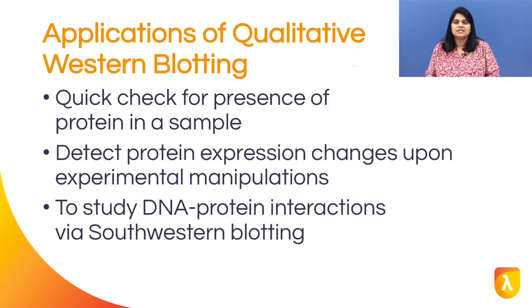A qualitative Western blot can even be used for studying DNA-protein interactions via Southwestern blotting, where the exact concentration of the protein of interest is not crucial.